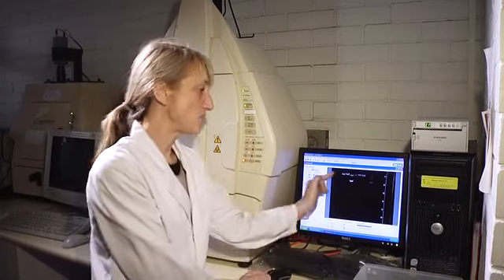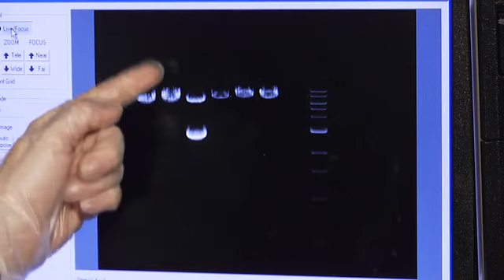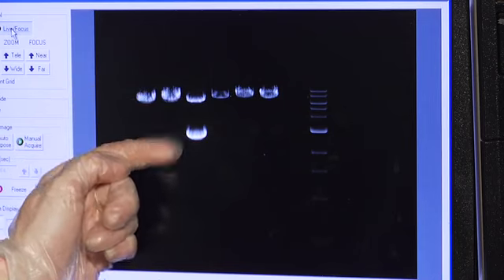Great! So, these samples here contain just the plasmid, but this sample here contains both the plasmid and the insert. And that's what we're looking for.